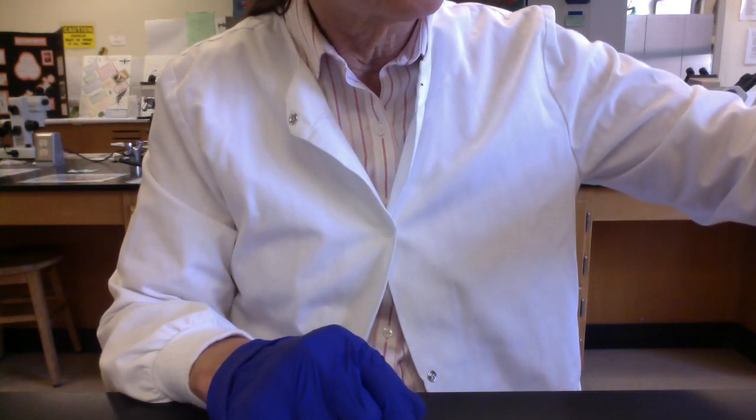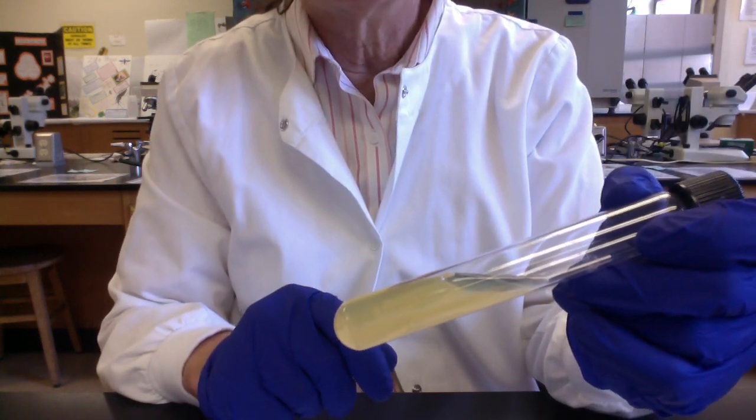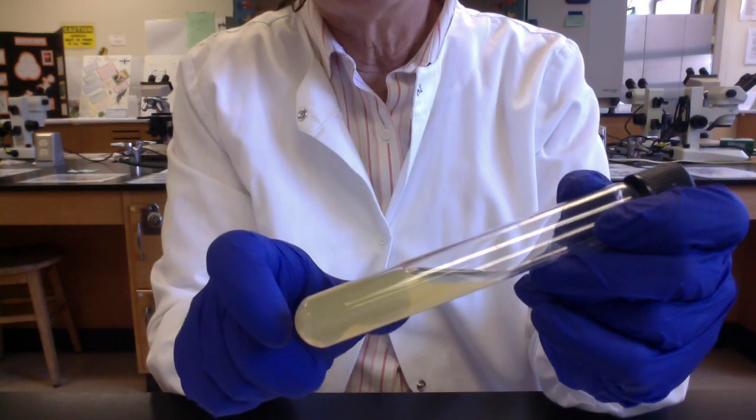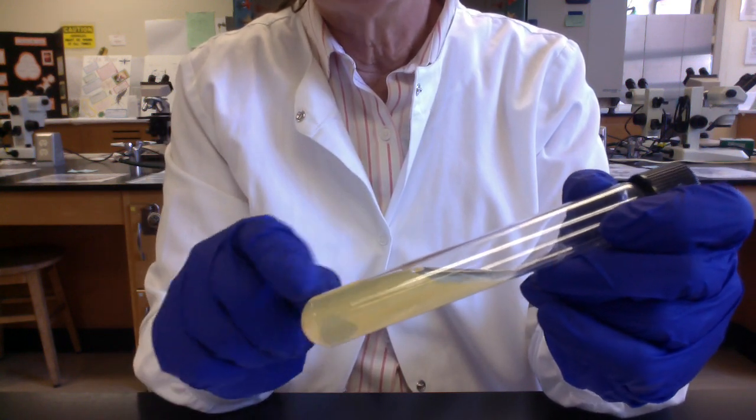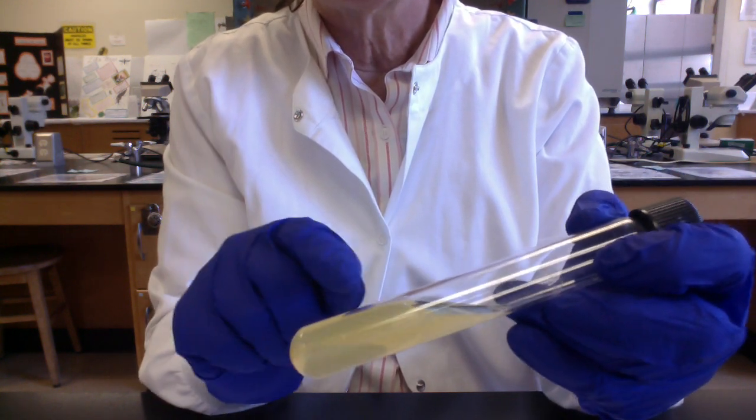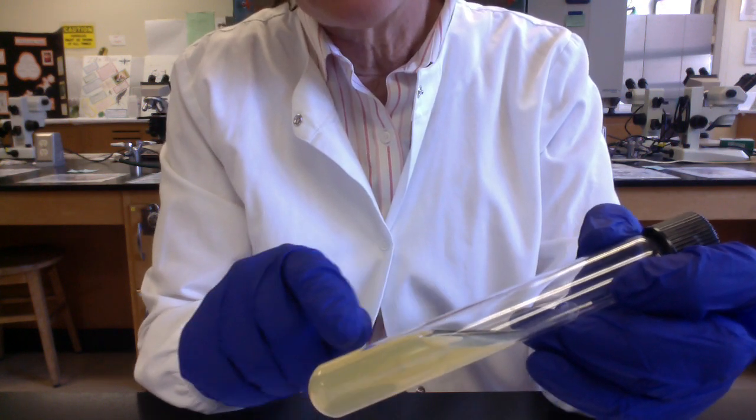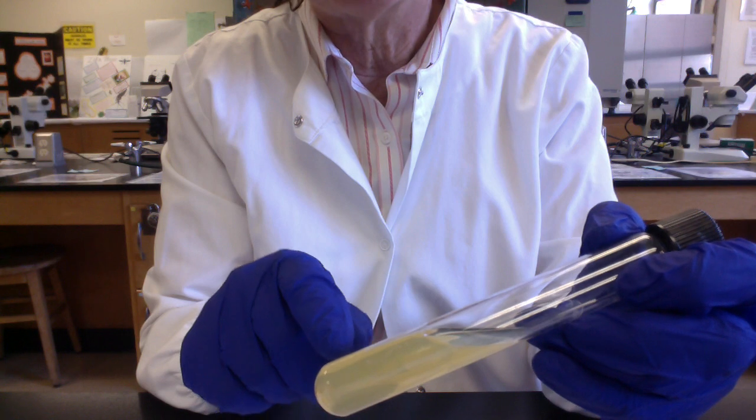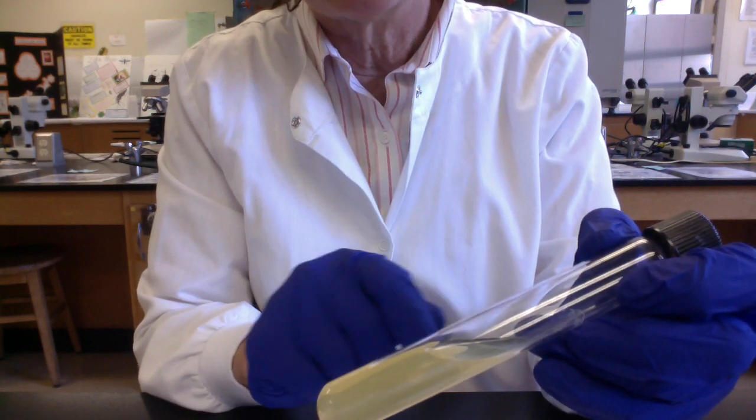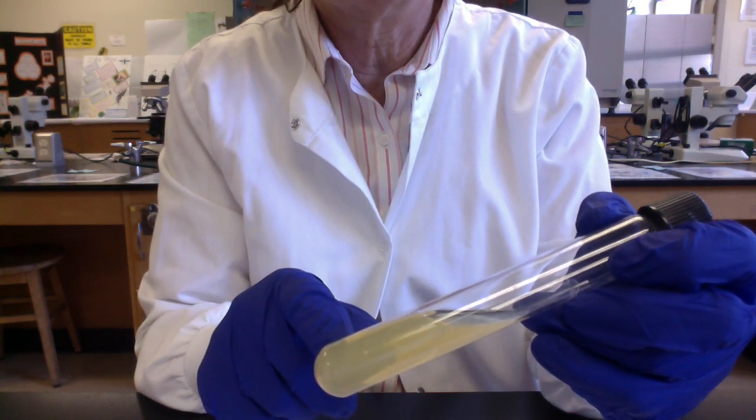For some of our tests, we're going to see if our microbes can grow anaerobically. And so we can use agar to test for anaerobic growth. You can see in this agar slant, there's quite a bit more agar in it. And this portion, which we call the butt, this is what we call a big butt agar slant. So we can use our inoculating needle and stab the agar butt with our microbes down to the bottom, deposit the microbes there, then withdraw our needle, incubate. And if we can see the microbes are growing in the anaerobic butt, that suggests they can grow anaerobically.